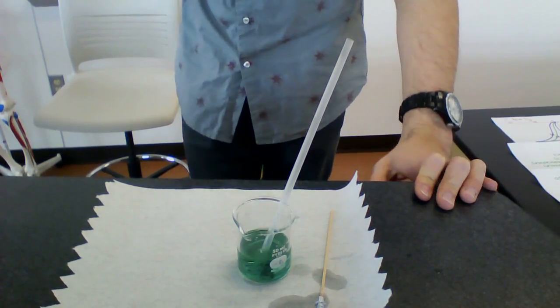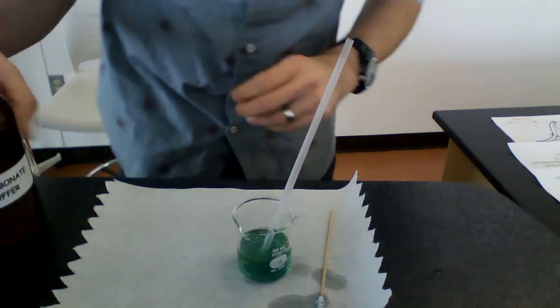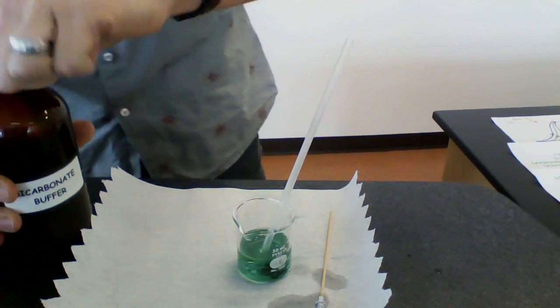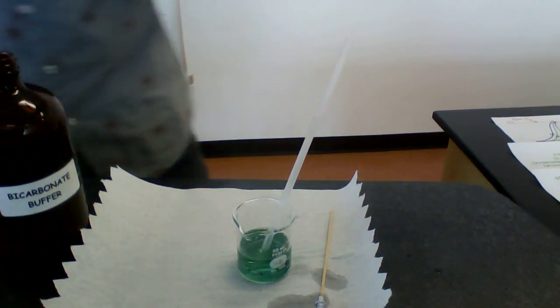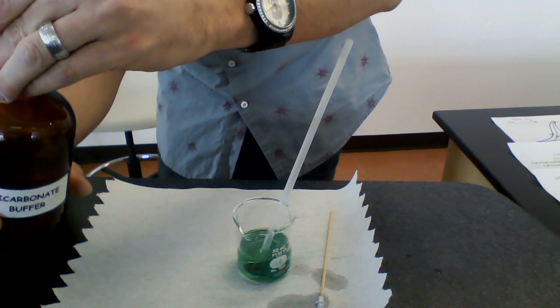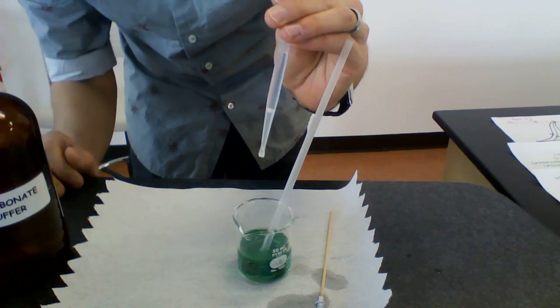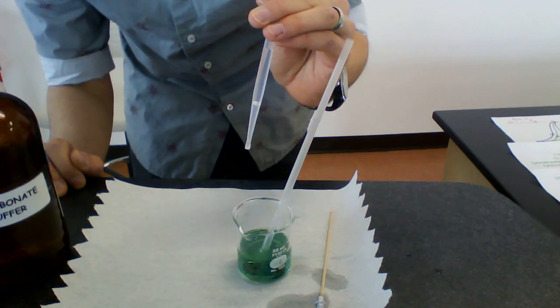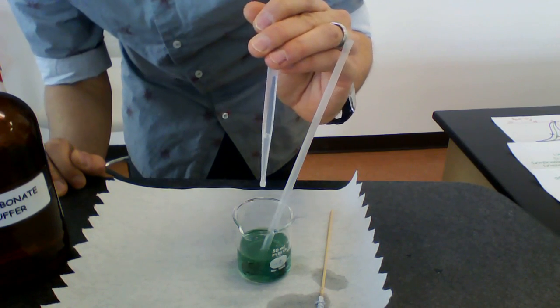What we need to do is buffer this. So I'm going to take some bicarbonate buffer. I'm going to put a bunch in, probably about 2 milliliters or so. This is plenty to buffer about 25 milliliters of water.